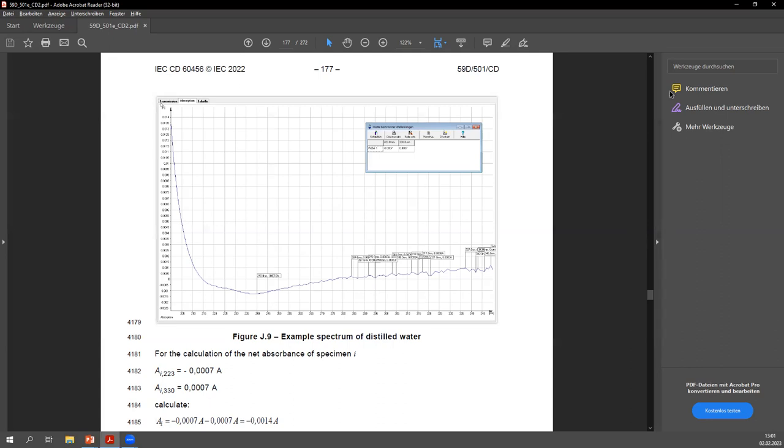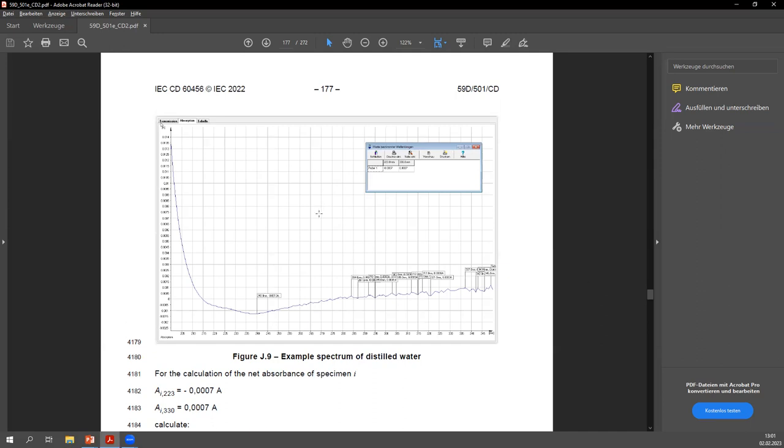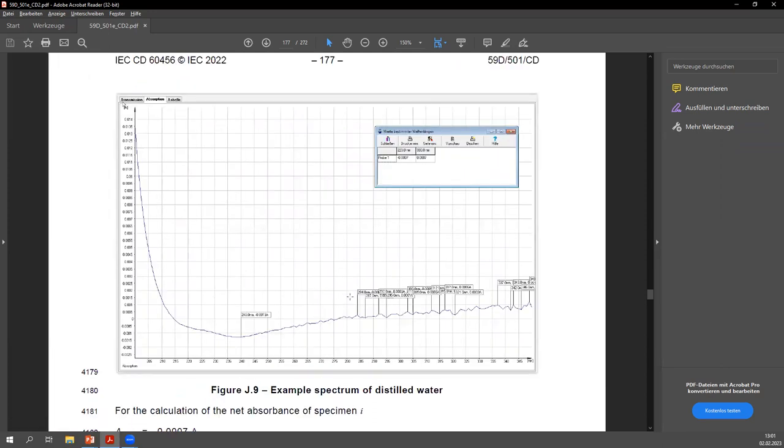Quality control always means not measuring only the wavelengths which we refer to for the calculation of the results, but measuring a spectrum of the range where we are measuring, because there may be influences on the sides of the spectrum, and maybe you have only the shoulder in the range where you are measuring. If you make a spectrum, you have a clearer view of what is happening. In the standards, it says always, if you have problems, take a spectrum of the sample you are measuring. So in cases of doubt, take a spectrum. That's the recommended way. Does this answer your question? Okay, thanks. You're welcome.